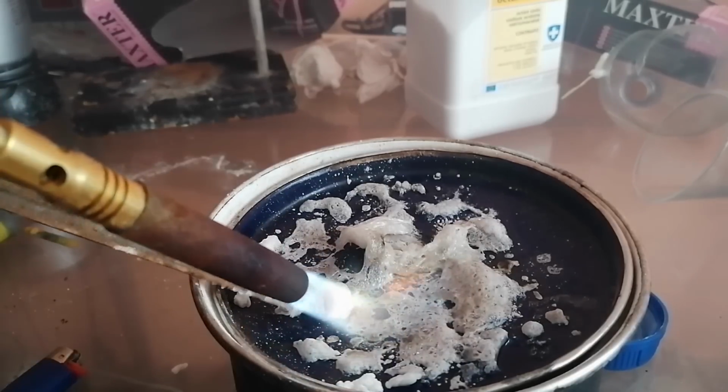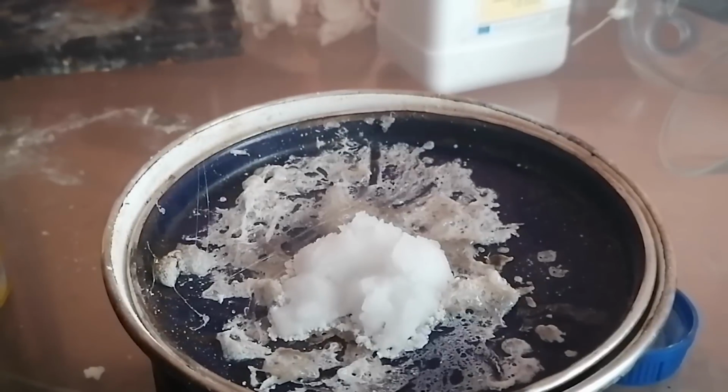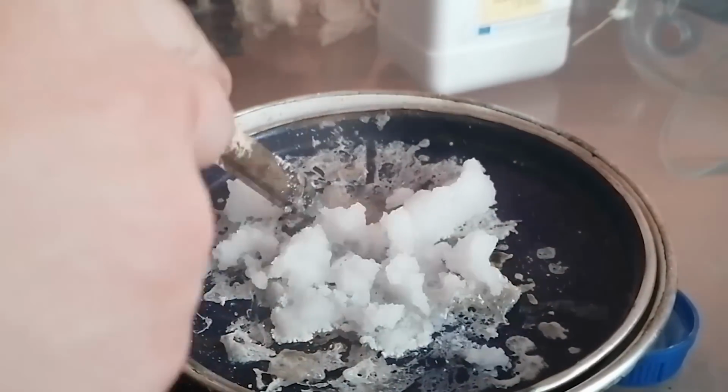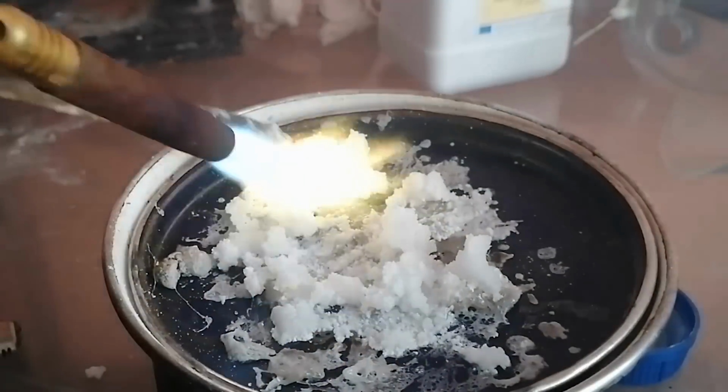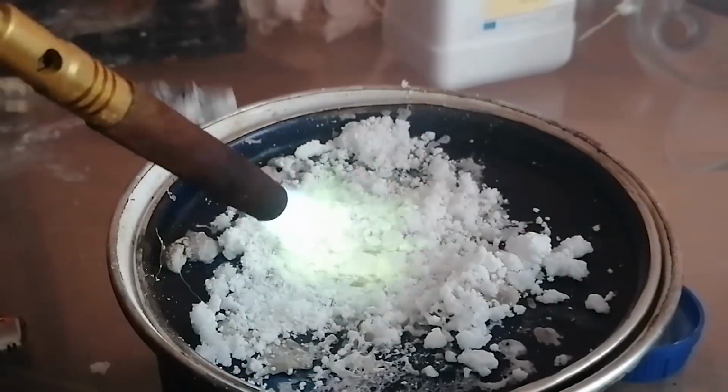However, I was not happy with the amount of the oxide, so I've added more of that boric acid on the cooking pan. And I actually really like how it was searing as if it was cold meat. While I'm heating this, I just cannot express enough how much I like the color of boron ions. It's just such a cool color.